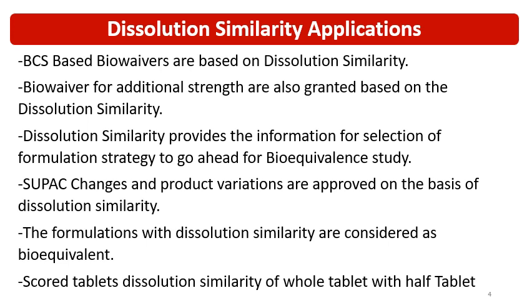Dissolution testing and dissolution similarity start from R&D, scale up, technology transfer and commercial production, and continue through the life cycle. If the product is manufactured at one site and is required to be transferred to another site, dissolution similarity is also required to be established at that time.